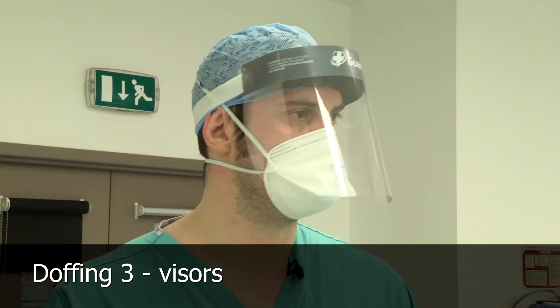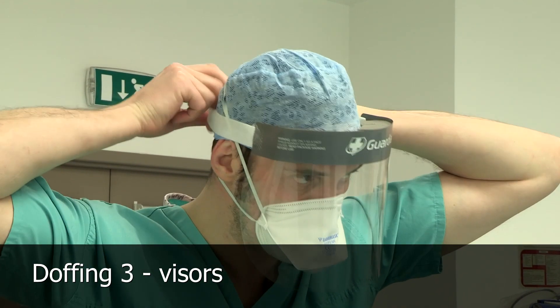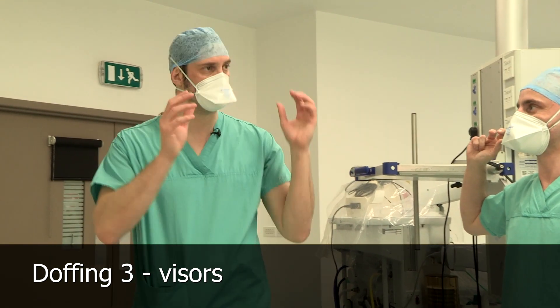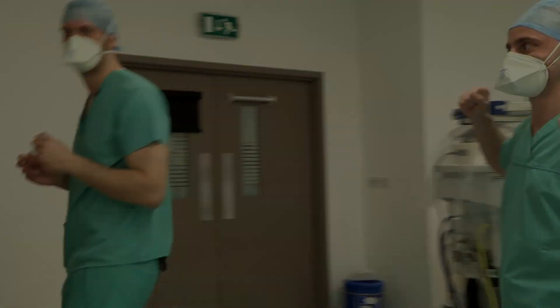There's one more thing in here before we leave — we need to get rid of the visors. Doffing the visors: hands behind heads. If you've got these ones, you pull the strap forward, lean over and just let it drop. For the next stage of doffing we do in the anteroom, so we'll get Savvas to open the door so we don't touch anything until we're back in the anteroom.